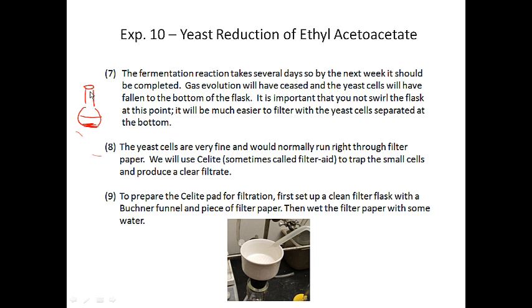And it's important when you pick up your flask and take it back to your hood that you don't jiggle it so much that you resuspend the yeast, because it's going to be a lot easier and a lot faster to filter if the yeast stay at the bottom of the fermentation flask.